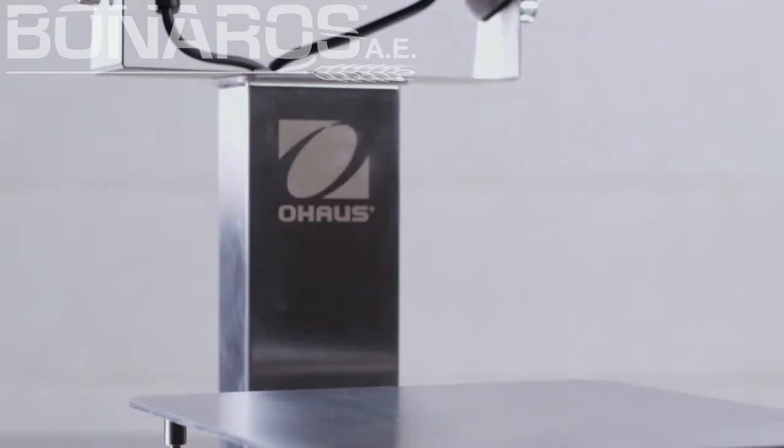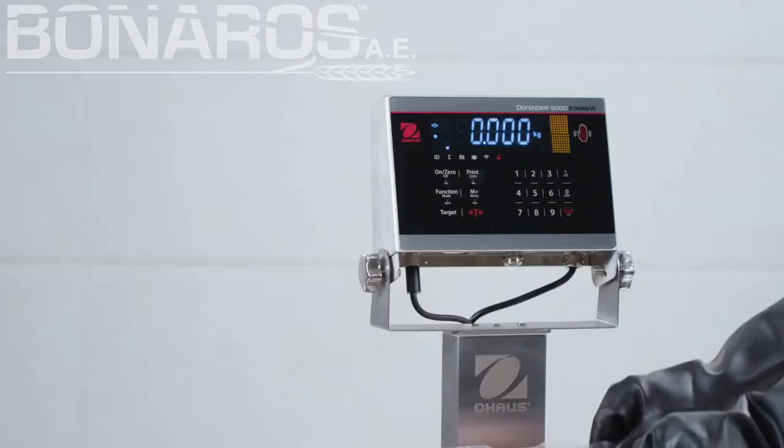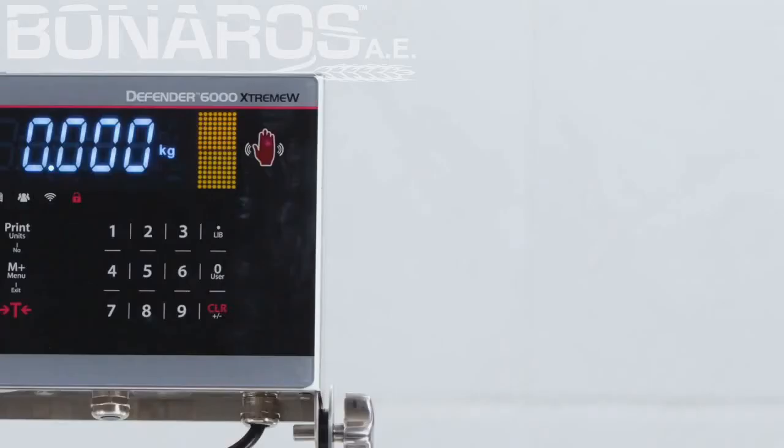Featuring stainless steel housing, non-slip rubber feet, and hermetically sealed load cell. Defender 6000 offers two options for indicators: 316 stainless steel and polycarbonate housing.